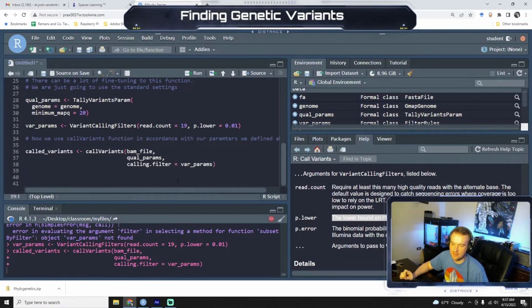The other thing you can do, if you're more into human genetics, is use SNPs for genome-wide association studies, which we're going to do in a later section. The theory behind that is you can identify SNPs that are tightly linked, so they're very close in location to a gene of interest. So you get a SNP map for your entire genome using a variant calling workflow, I guess is the best word.